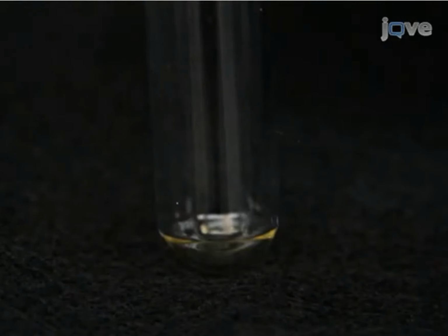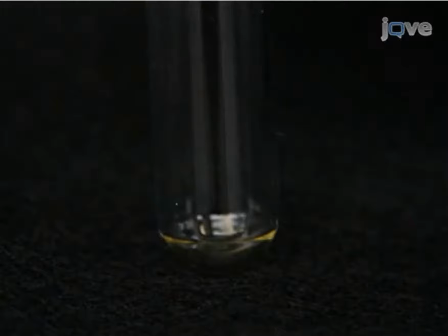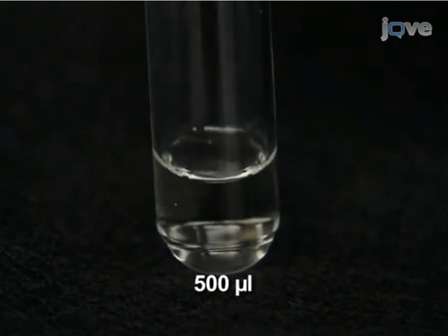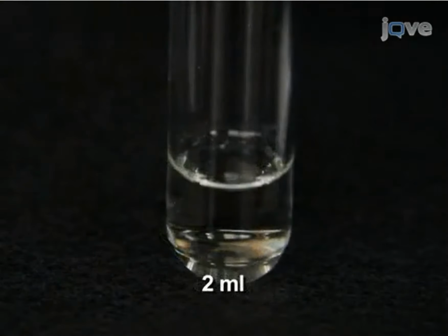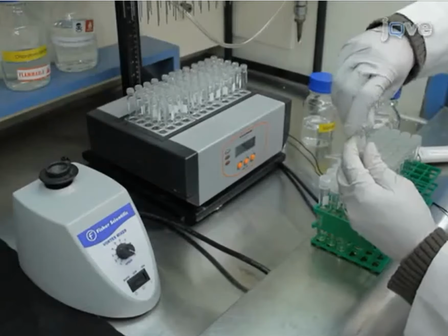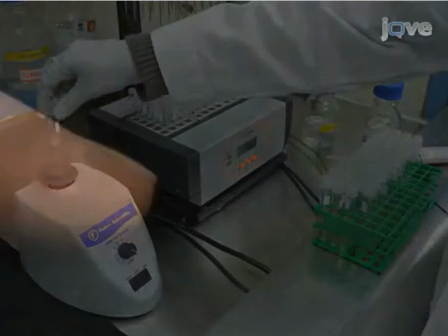In the final steps, the alditol acetates are extracted. First, add 500 microliters of ethyl acetate and swirl lightly. Then, add 2 ml of water, cap the tubes, and vortex.